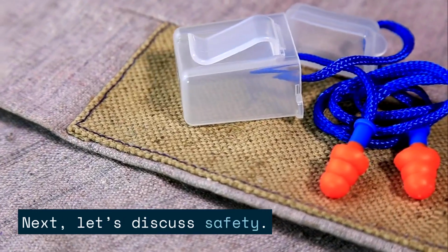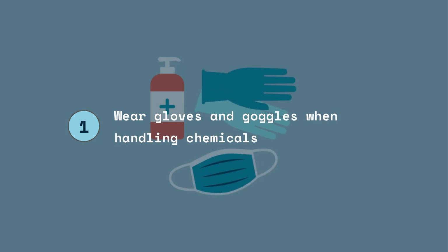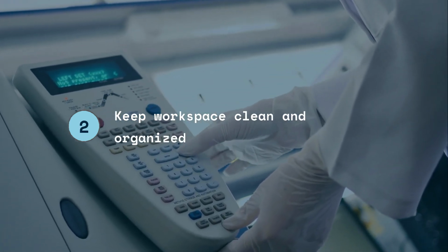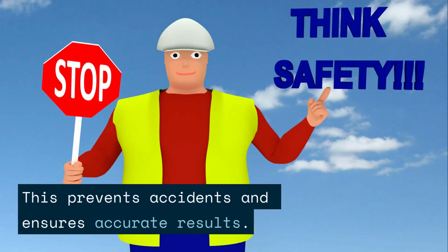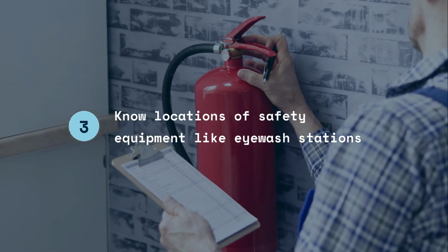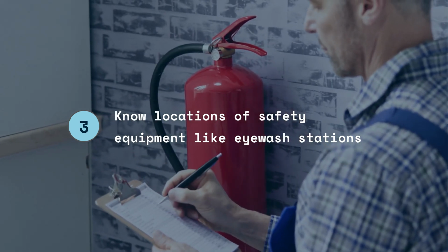Next, let's discuss safety. Always wear gloves and goggles when handling chemicals. Make sure your workspace is clean and organized. This prevents accidents and ensures accurate results. Familiarize yourself with the location of safety equipment, like eyewash stations and fire extinguishers.